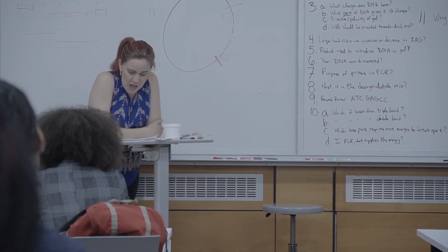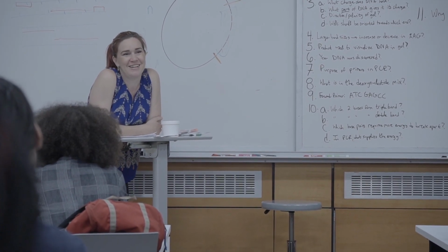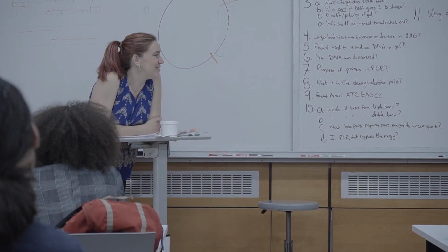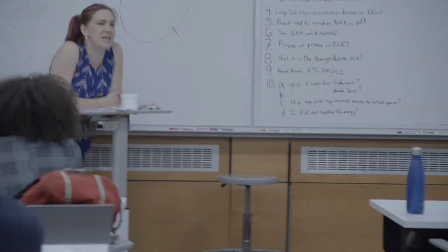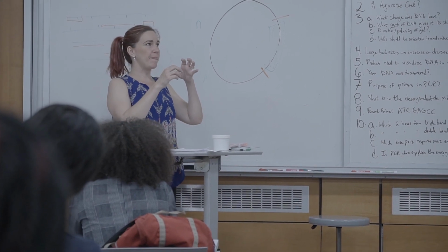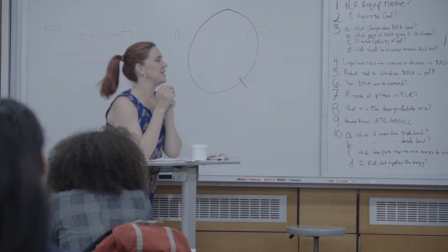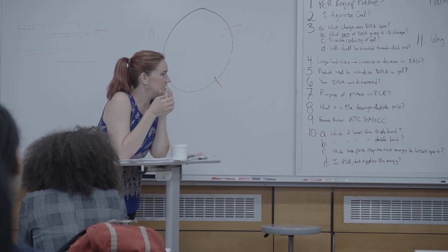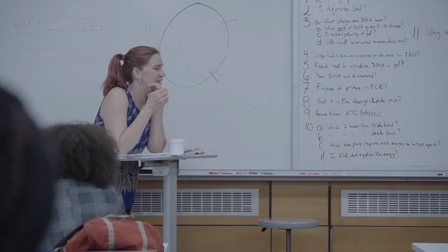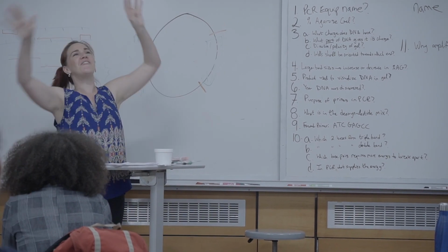If you're trying to separate larger size bands, do you want to increase or decrease your agarose? No, you actually want to increase it. Yeah, so let's think about why. Wait a minute, sorry. No, maybe I said it backwards actually. It's lower. You want to decrease it to separate larger bands. Yeah, sorry. We were all right.